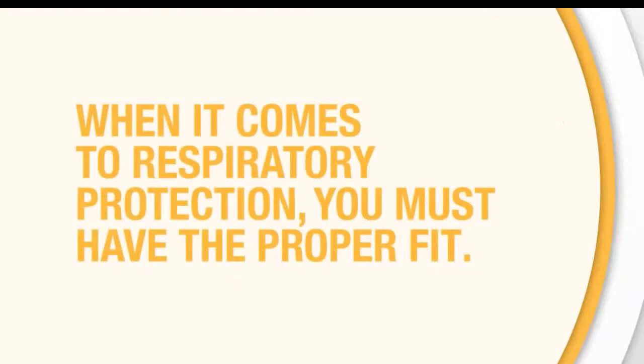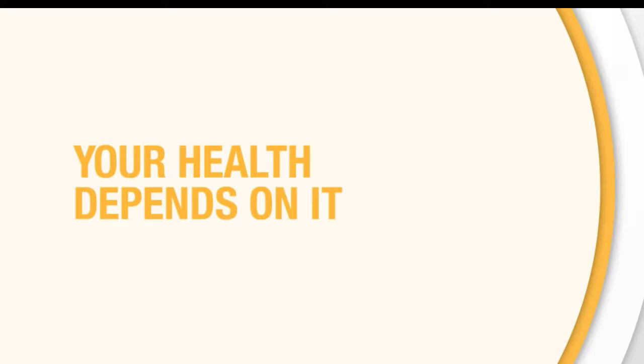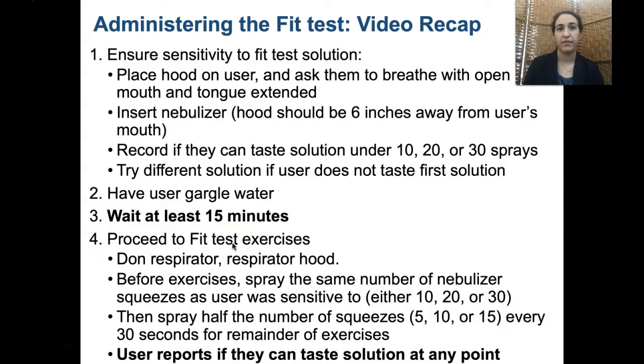When it comes to respiratory protection, you must have a proper fit. Your health depends on it. Here are some of the highlights from the training video. Remember, it's important to ensure that the user can taste the fit test solution.